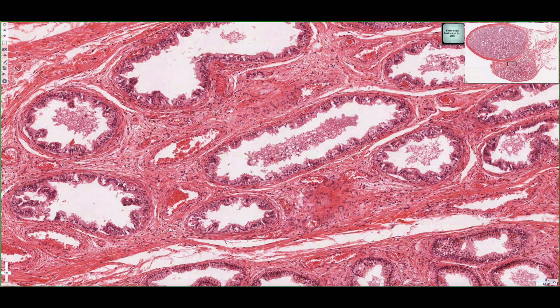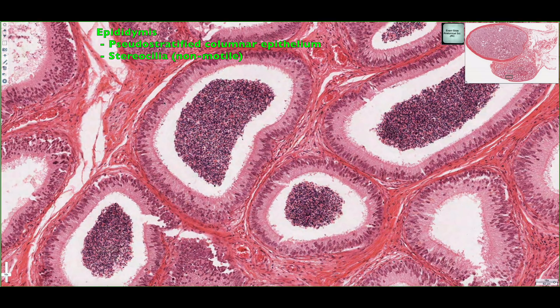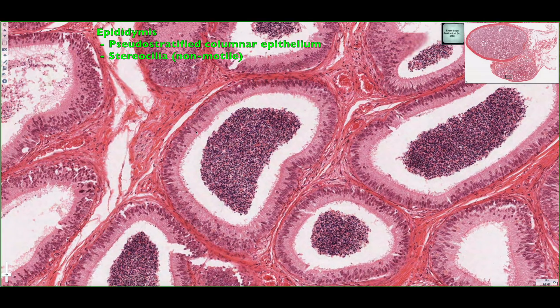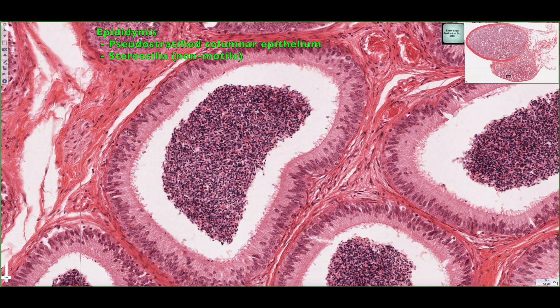Comparing the epithelial lining of the efferent ductules to the epididymis, we can see quite a different appearance. Here in the epididymis region, we have a pseudo-stratified columnar epithelium lining the epididymis all around, and then we can see little basal cells against a basement membrane. These are stem cells that help rejuvenate and replenish the pseudo-stratified columnar epithelium.